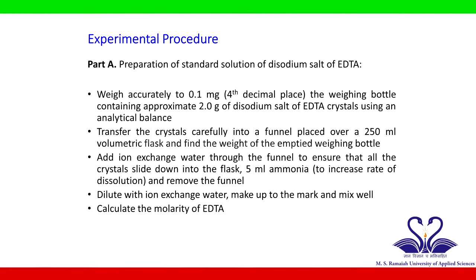Now add 5 ml of ammonia to increase the rate of dissolution of disodium salt of EDTA. Dilute with ion exchange water. Make up to the mark and mix well. Finally, calculate the molarity of EDTA and transfer it into the burette.